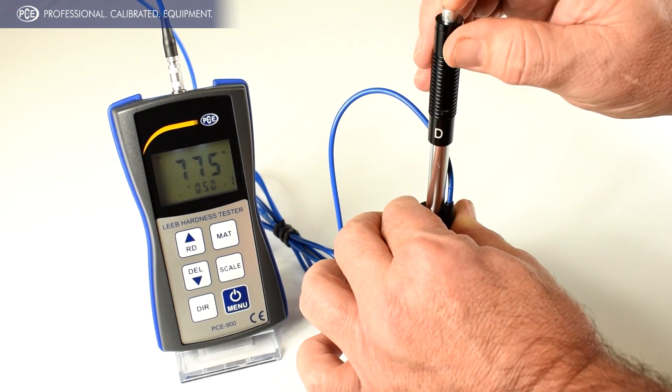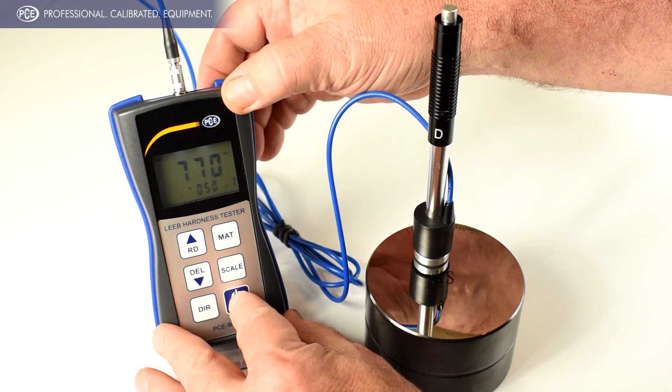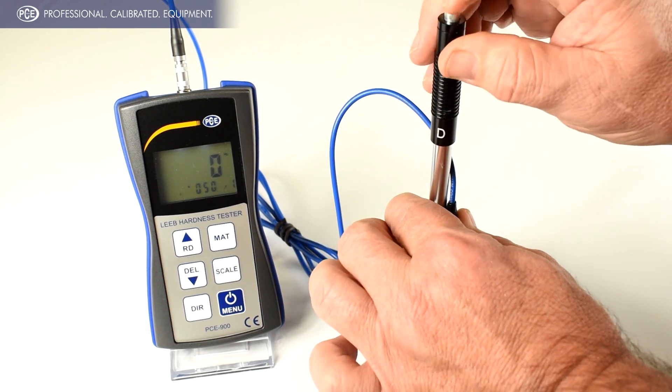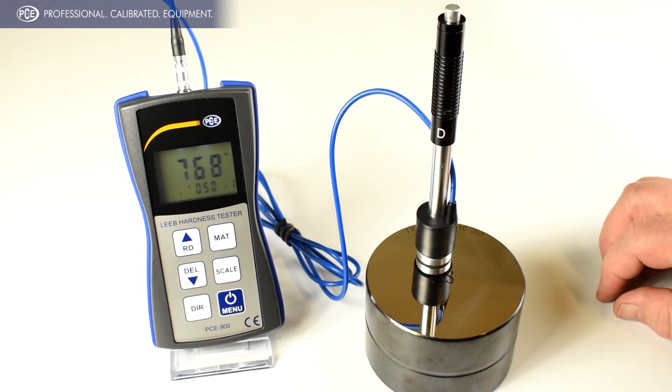Take another test. 770 is within range, so we're going to take it out of CAL mode. Take a measurement to verify — that is within the range of the 775 test block.